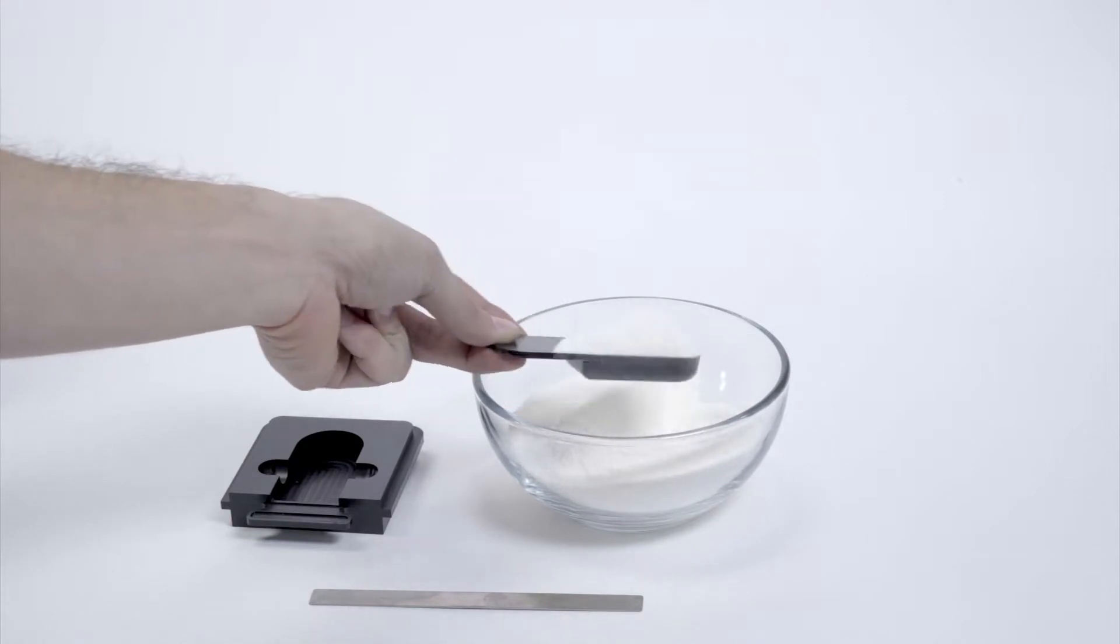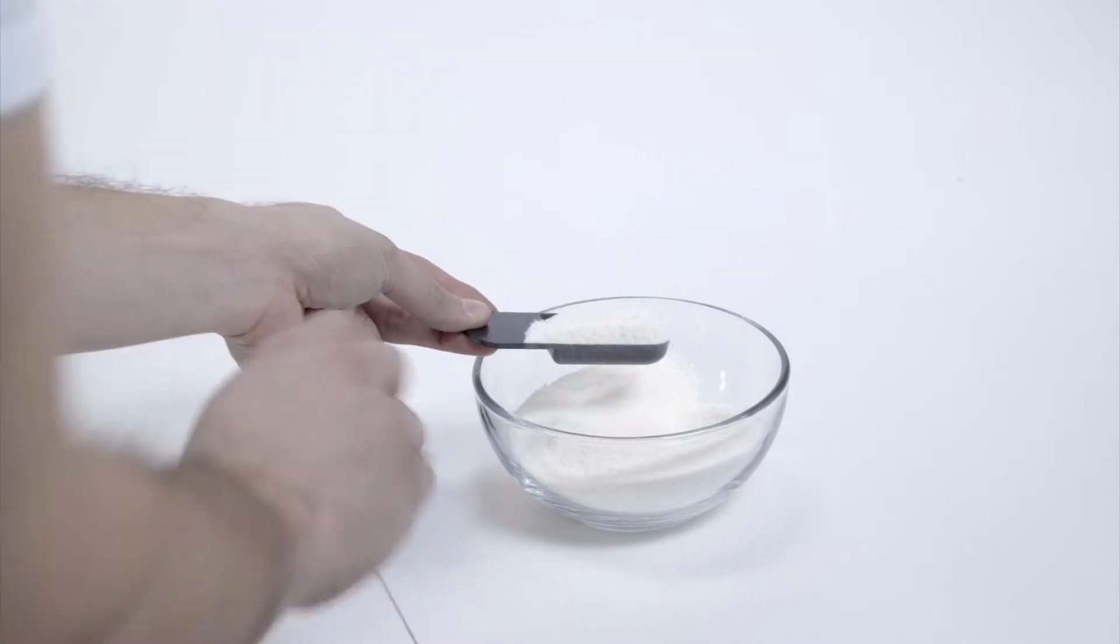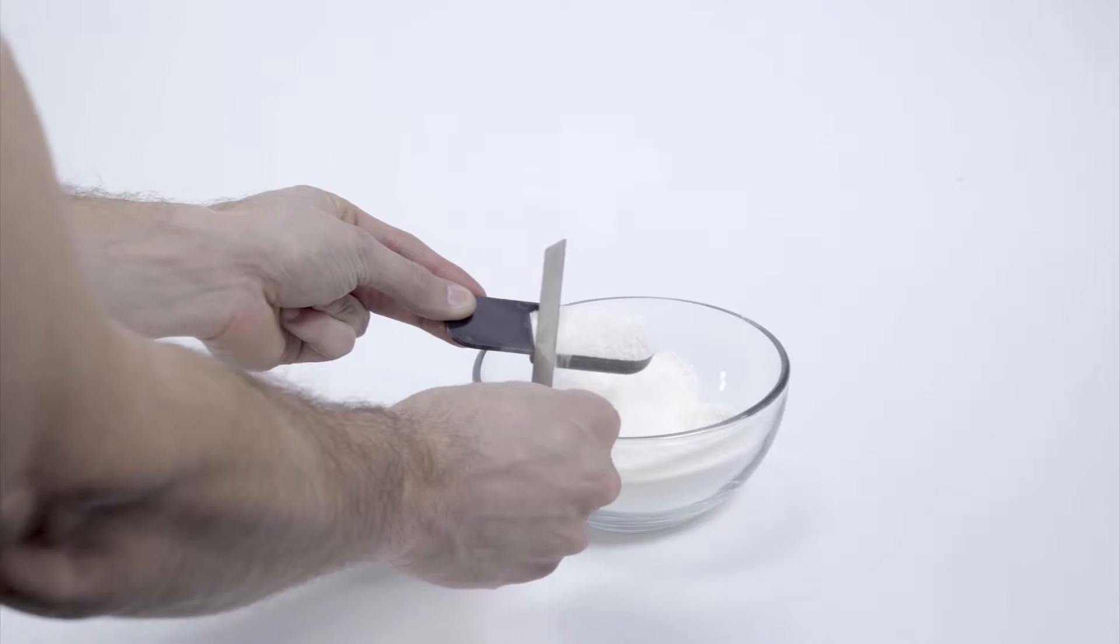Powders or granules can be put into a spoon and leveled, and the spoon placed into the sample holder. The material is correctly prepared for measurement.